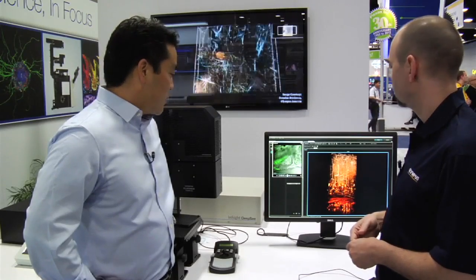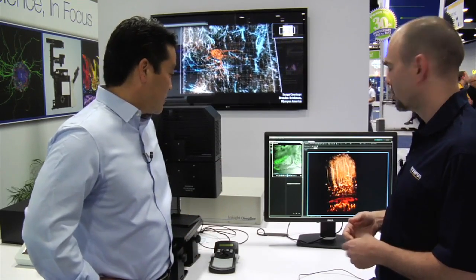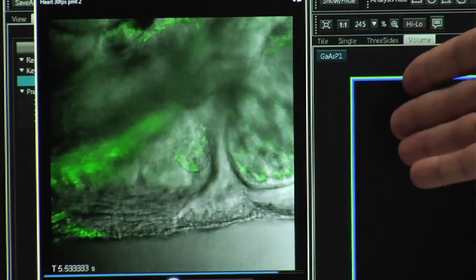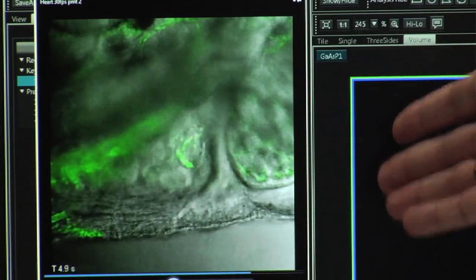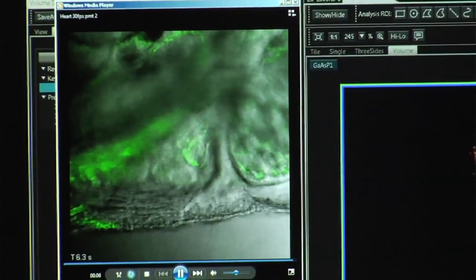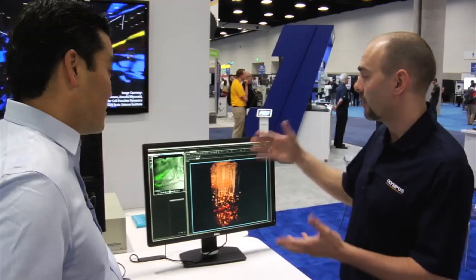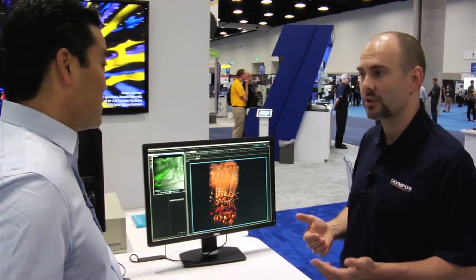Earlier you mentioned the speed of acquisition — how many frames per second you can get. Can you walk us through some data that illustrates that? Everybody knows what a beating heart looks like. Here we have a data set acquired at 512 by 512 pixels at 30 frames per second, capturing that with really good definition in both bright field and multi-photon with some genetically tagged GFP cells — very crisp, clear definition. Now if we want to go even faster than that, we can get up to as high as 438 frames per second.